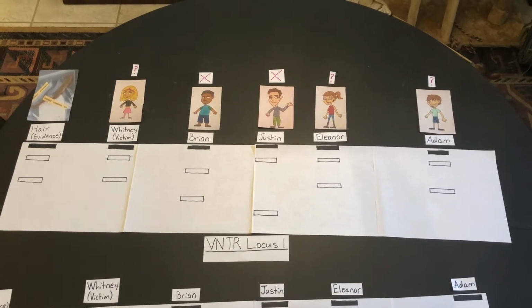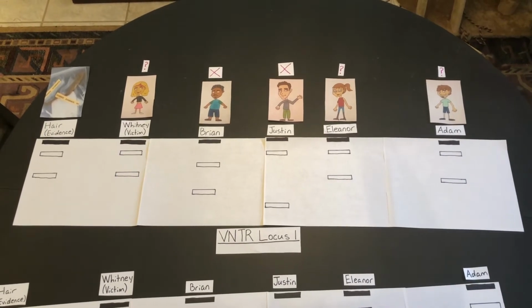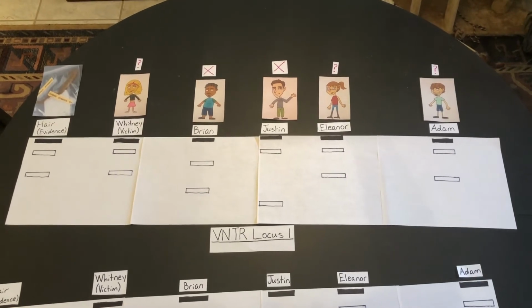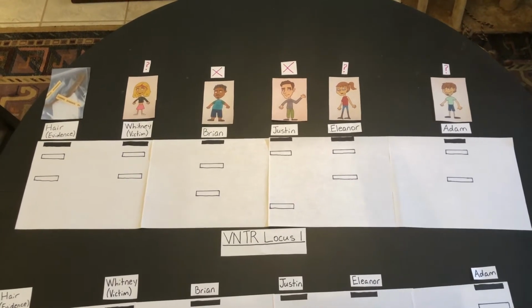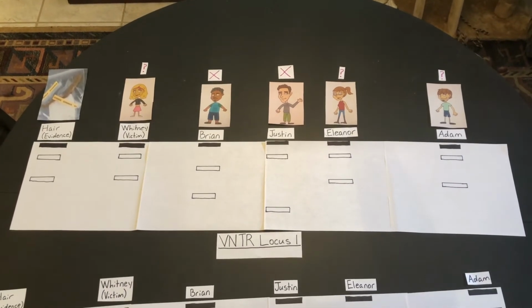In VNTR locus 1, we can see that the bands or alleles of the evidence match at the same loci with that of Whitney. This means that her profile is consistent with leaving the DNA evidence at the crime scene, and we cannot rule her out just yet. For Brian, both alleles do not match at the same loci with the evidence. This means we can exclude Brian from leaving the DNA evidence.